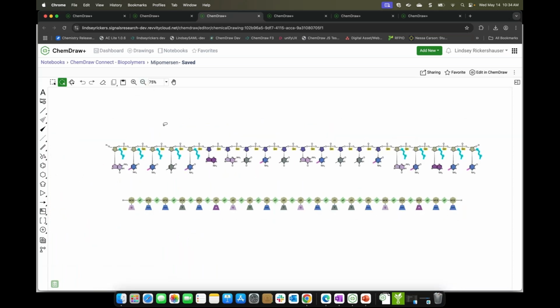And you can start seeing these are really non-standard monomers that have been used to build this drug. So on the first five, 1, 2, 3, 4, 5, and last 5 nucleotides, you have a ribose modification that is methoxyethyl.